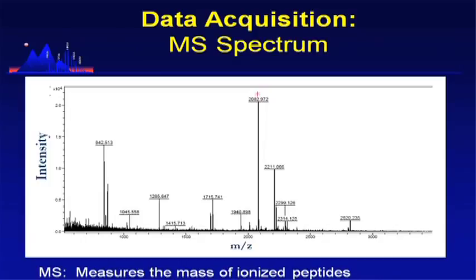This is one thing I'm not going to go into in this lecture, but I think later Nicole gives you a lecture on quantitative analysis by mass spectrometry. What I'll say is that mass spectrometry is not a quantitative technique. The height of this peak is based on how many ions we detect, but how many ions we detect is based on both how much is there and also the ionization efficiency of that particular molecule. How well does it take on a charge?